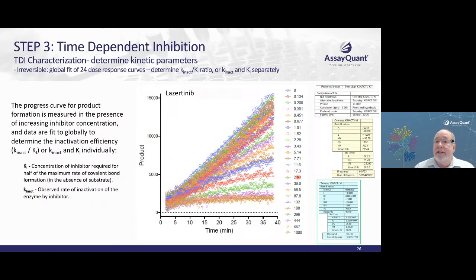For irreversible inhibitors, things get even more tricky, okay? IC50s are useless for irreversible inhibitors. You really need to report these kinetic parameters. And folks in the protease field know this totally, because there's tons of irreversible covalent inhibitors in proteases. But this has been slow to penetrate other therapeutic areas, especially anti-cancer agents. And you'll often see IC50s in the literature reported for these kinds of compounds. And if you see that, you know that these folks aren't quite sure of the experiments that they're doing here.